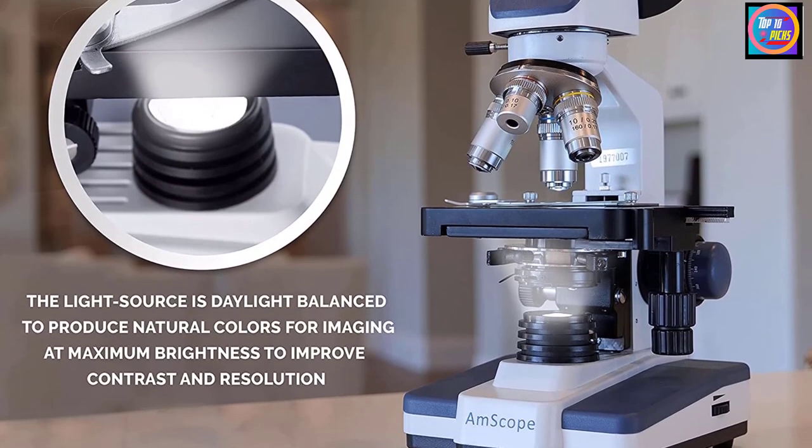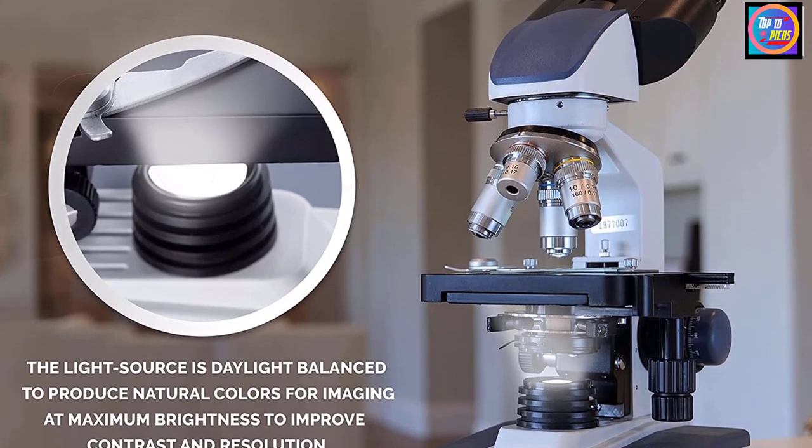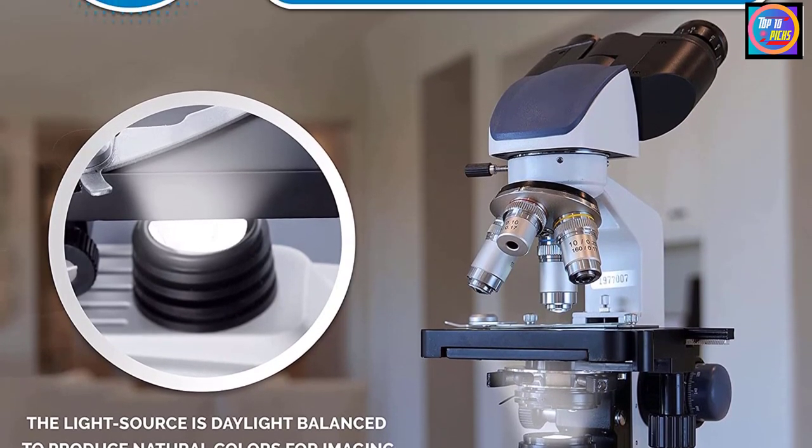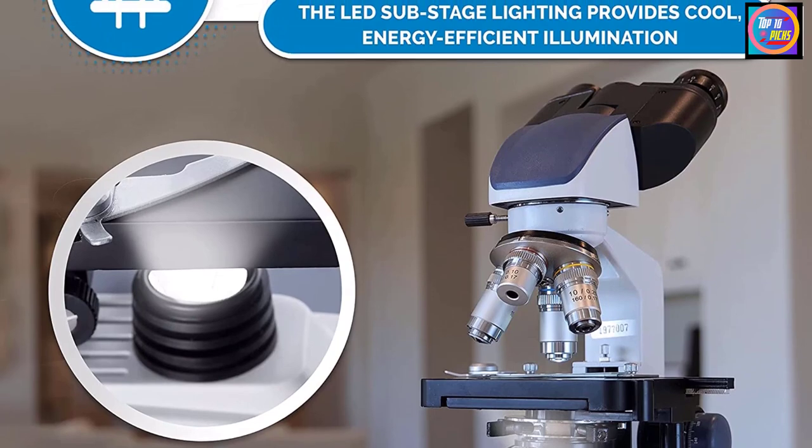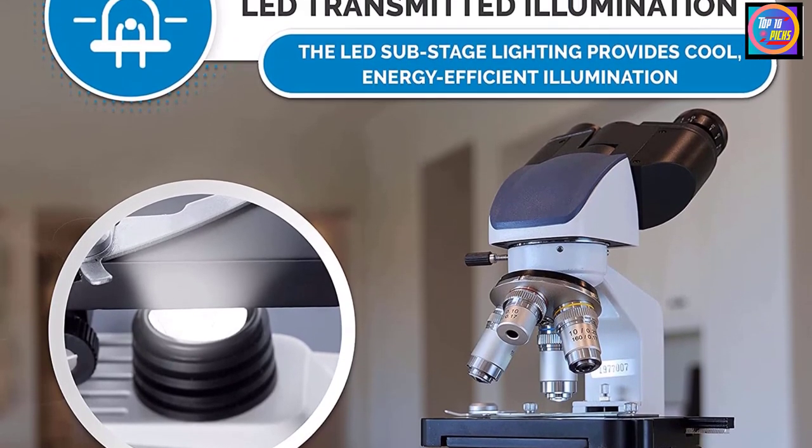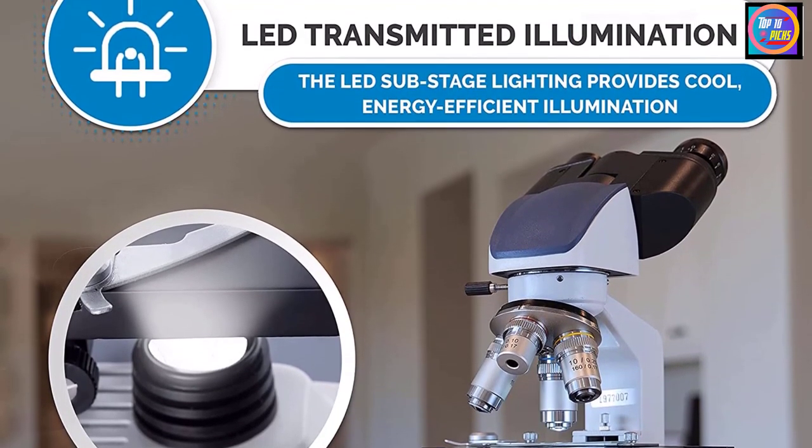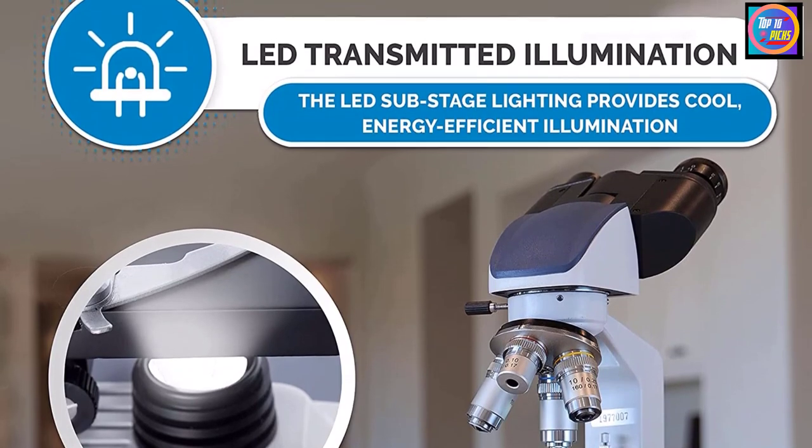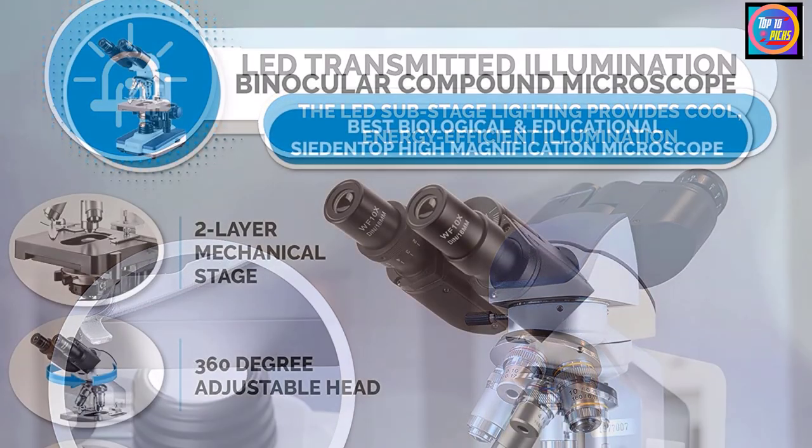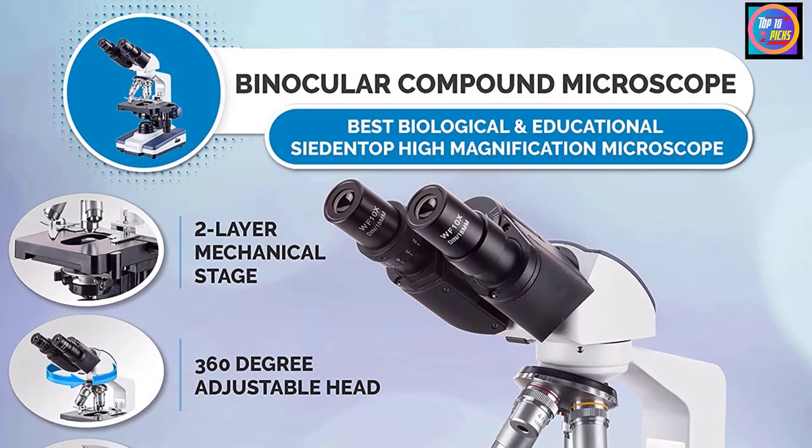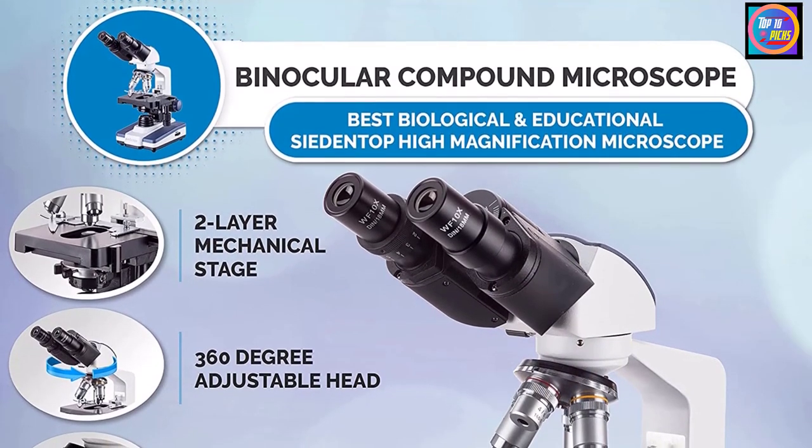The Ampscope B120C compound binocular microscope has pairs of 10x wide field and 25x wide field eyepieces, a forward-facing nose piece with 4 DIN achromatic objectives, bright field LED illumination, a 1.25 NA Abbe condenser, and a double-layer mechanical stage.